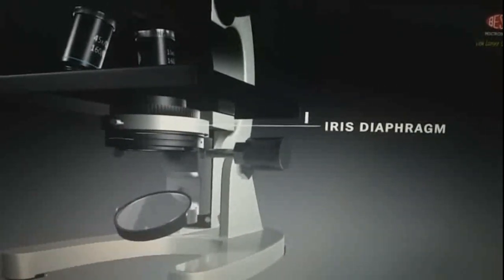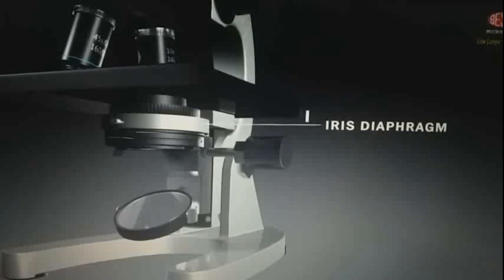I, iris diaphragm. It is used to control the diameter of the cone angle of the light transmitted over to specimen.